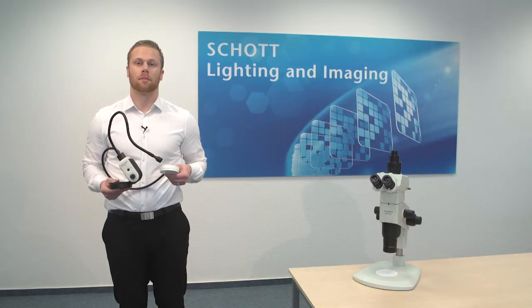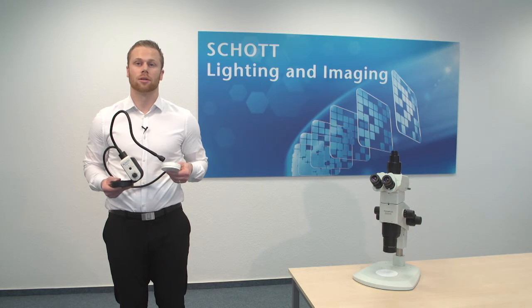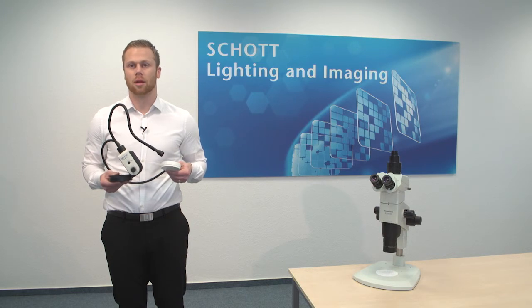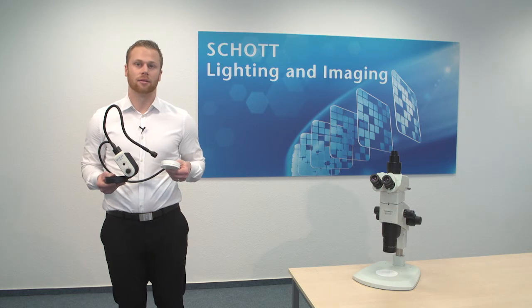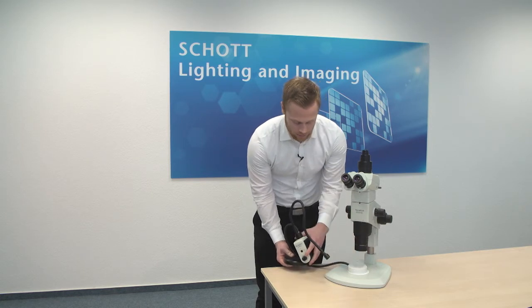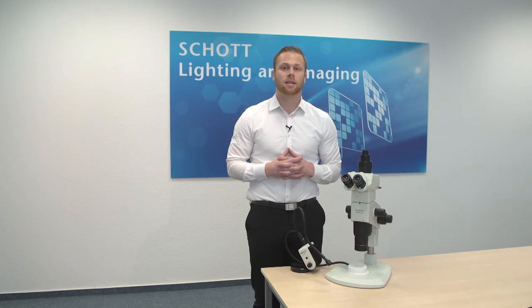If you cannot use a connector for your microscope, the KL300 LED also serves as a standalone solution. As you can see here, it requires a mount and these are sold separately. In this particular example, you can see a Combi light guide. This will allow you to illuminate your specimen from above and below. Simply place it next to the microscope and operate it as needed.